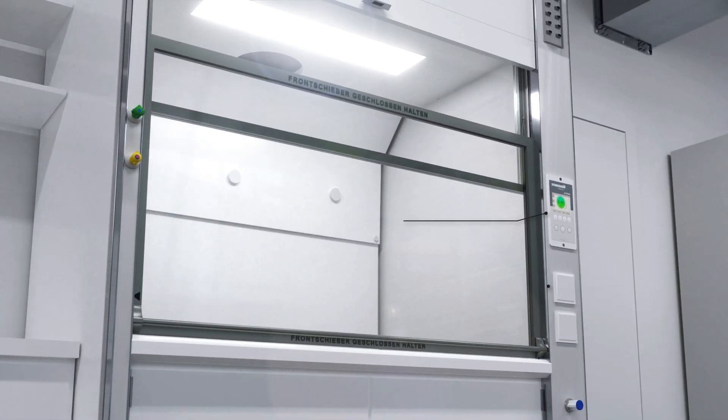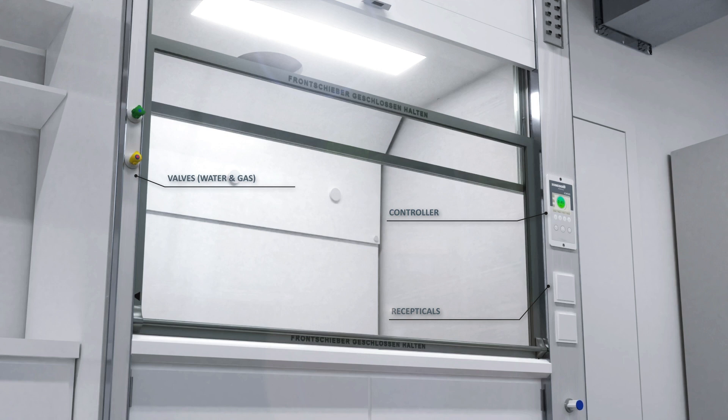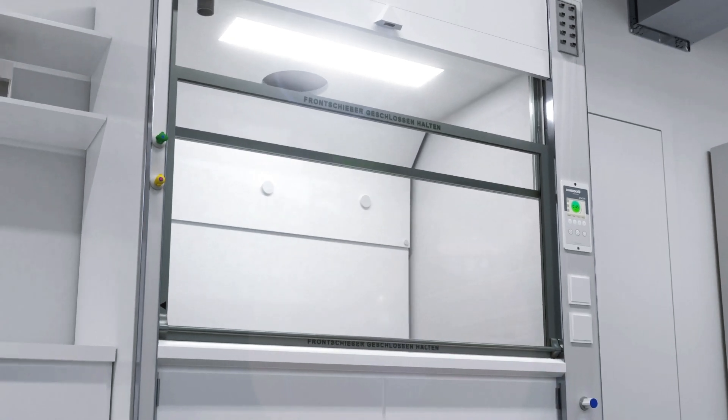This fume hood device consists of a state-of-the-art controller, receptacles, and safety valves.